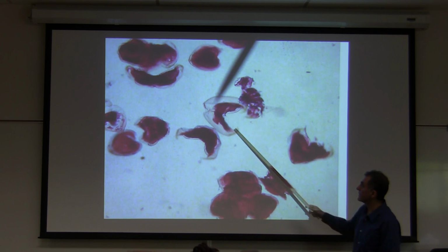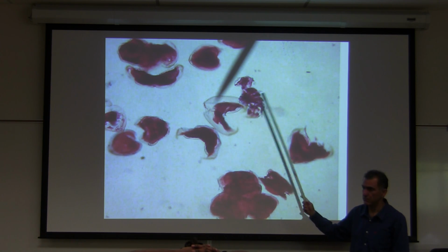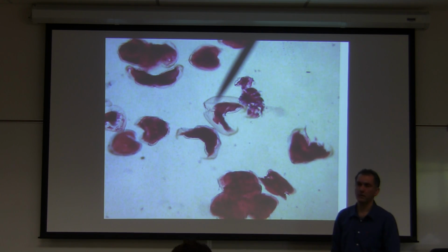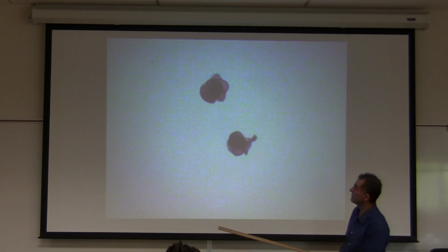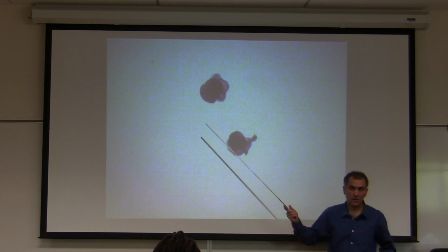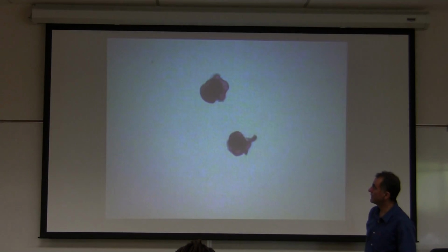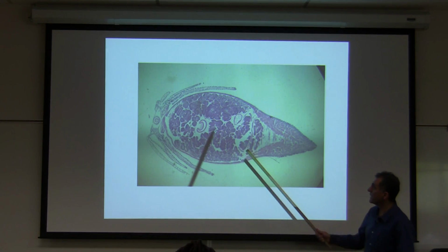Jose, what is the name of the structure? Glochidium. See, they have these hooks, Jose. They attach to the gills of fish and suck blood. That's what they are. Glochidium. Okay. What is the name of the structure? It looks like a miniature clam or snail. Veliger larva. Crepidula is the name of the organism, but it's a veliger larva. This is glochidium, veliger larva. Look at the slides over and over again. You'll see.